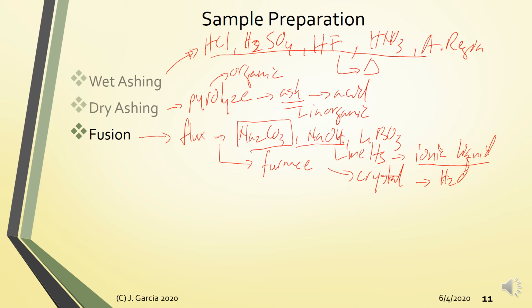All right, so that's fusion. Normally, you will encounter fusion sample preps if you're working with cement factories, for example, or geological samples. This is where they most likely would use the fusion sample prep technique.